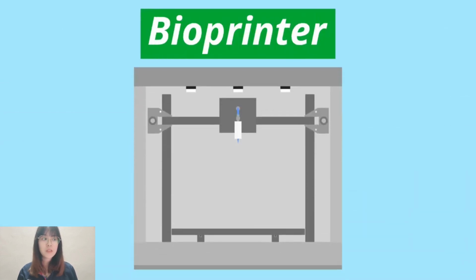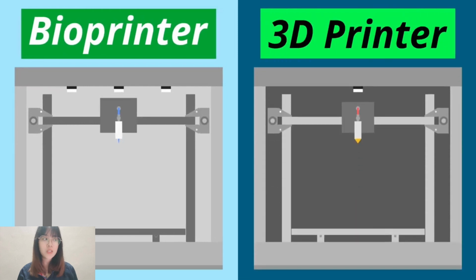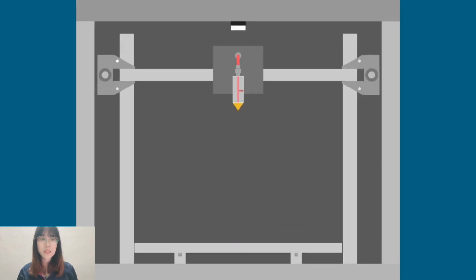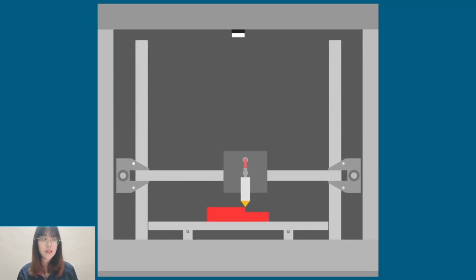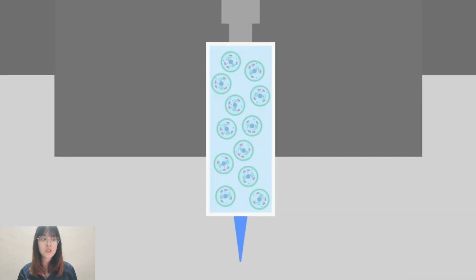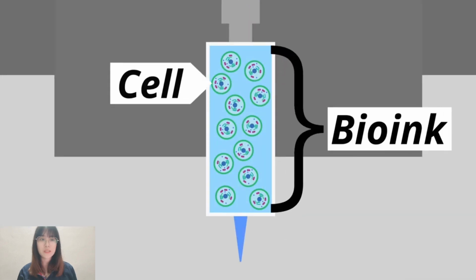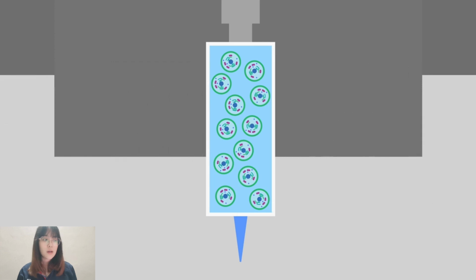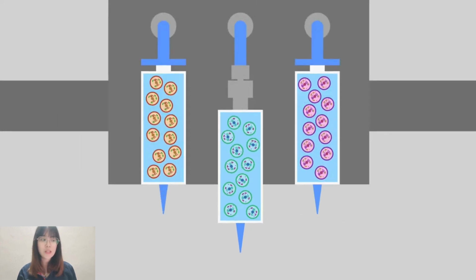The fundamental idea behind bioprinting is quite similar to that of ordinary 3D printing, which is usually done in plastic and prints one layer at a time. However, instead of plastic, bioprinters use bioink, which is composed of cells suspended in a special gel known as a hydrogel. Some bioinks use a single type of cell, while others contain multiple types of cells that are used side by side, each with a different cell type.